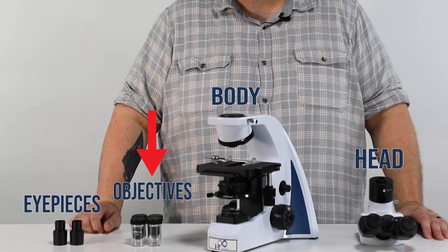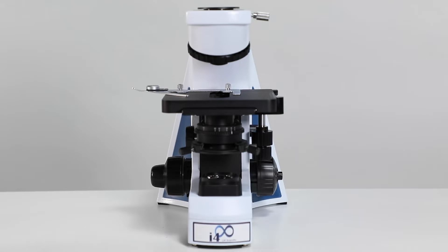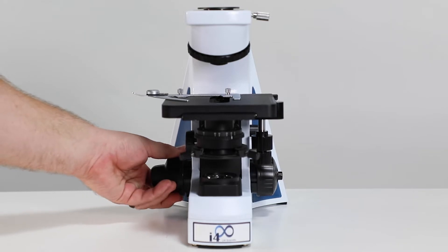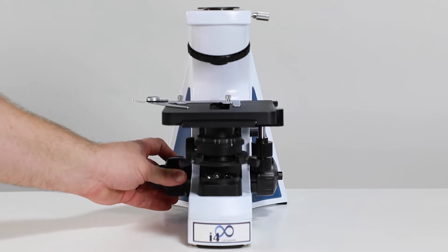We're going to start by installing the objectives. Drop your stage down by turning the course adjustment knob towards you until the stage stops. This will give you plenty of room to install your objectives.